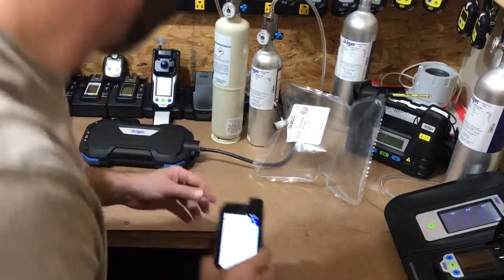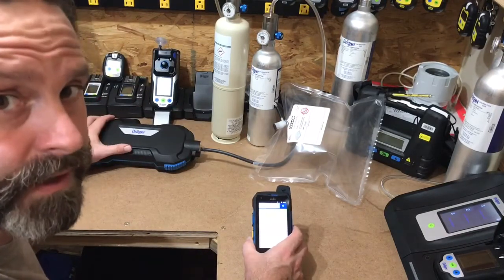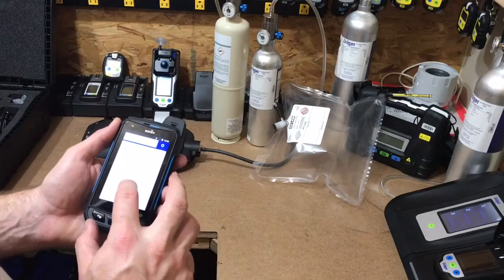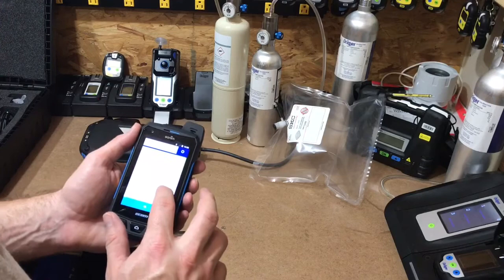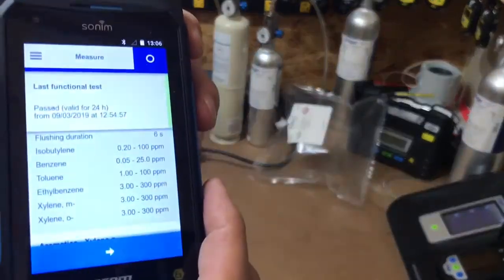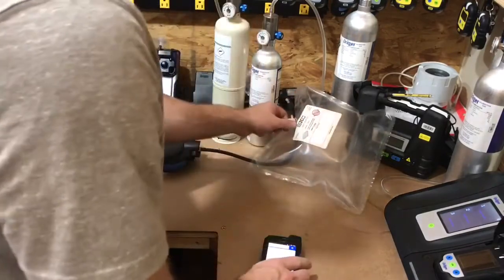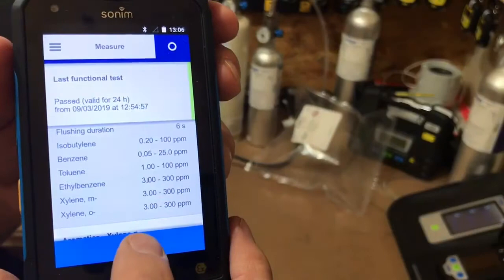So what we're doing here is a little example of what the new Draeger XPID can do — the gas chromatograph. What you saw from the pictures is that I filled up the test bag with isobutylene and toluene, and I already built a run here with a few more compounds. So let's open up the bag and see what this will pick up in a short period of time.